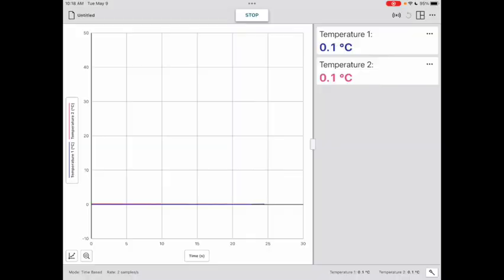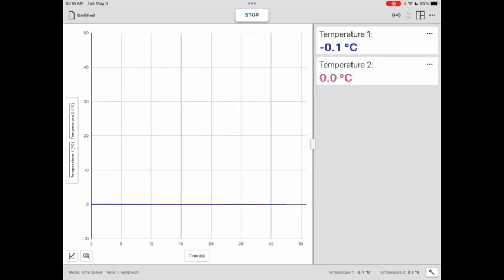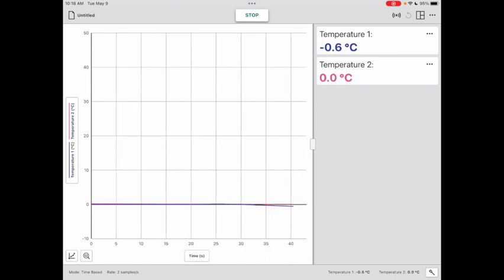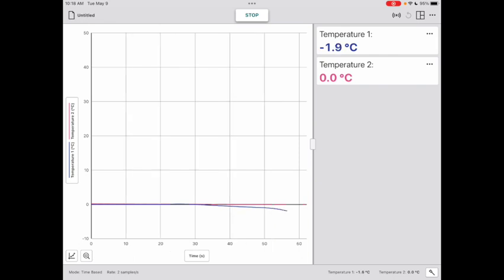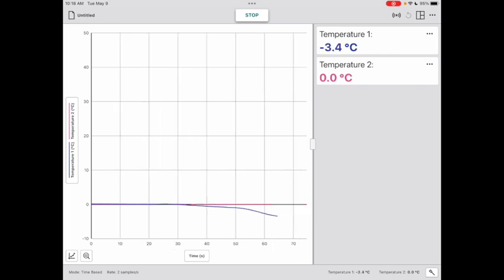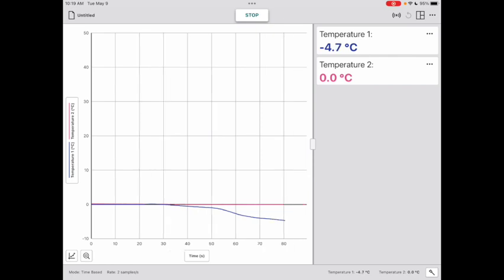Now once again, you've got two temperature probes. And as you can already see, the one that is in blue, which is the one that has salt in it, is dropping. We're already 2 degrees, 3 degrees, 4 degrees below zero, only after about one minute. So as you can see, adding salt to water changes its boiling point and its freezing point.